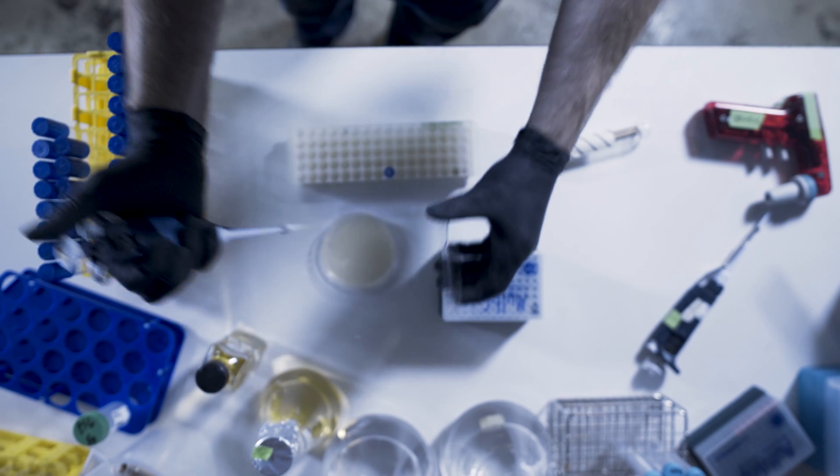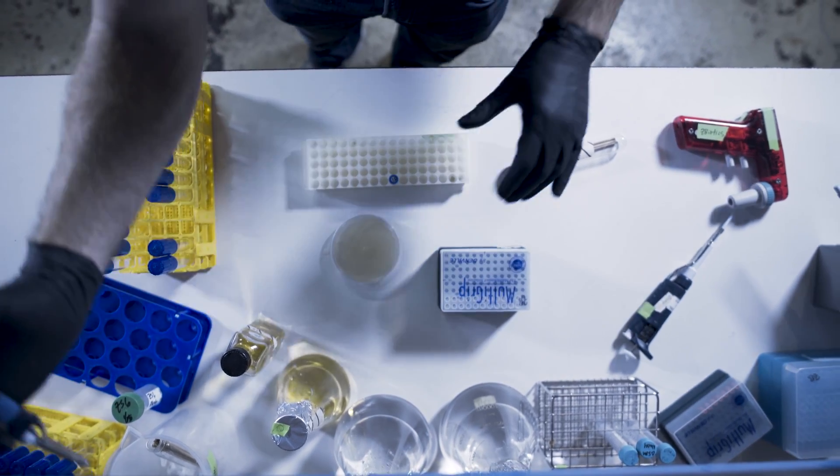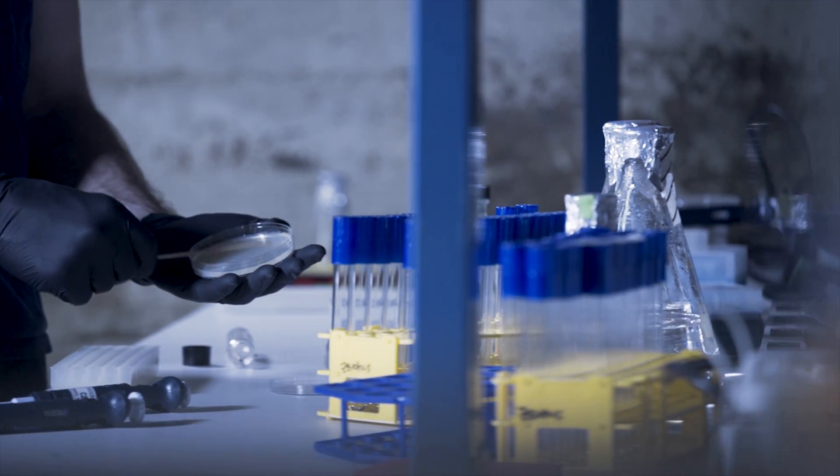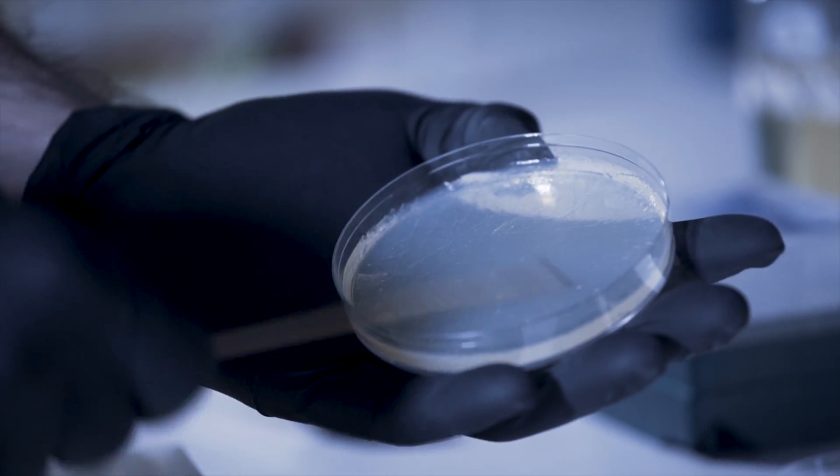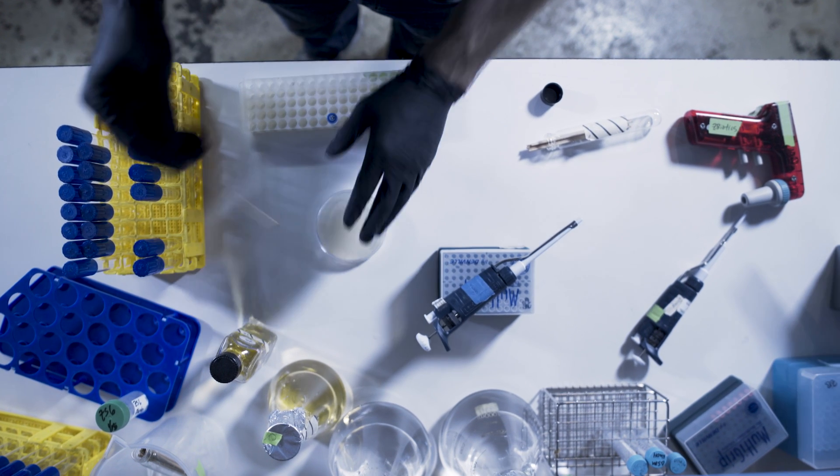We'll plate the culture on an agar plate with antibiotics that will only allow the bacteria that accept the foreign DNA to grow. At this point, some bacteria have integrated the foreign DNA and some haven't, but only the ones with the foreign DNA will be able to grow. So pretty much everything on the plate should be our genetically modified bacteria.